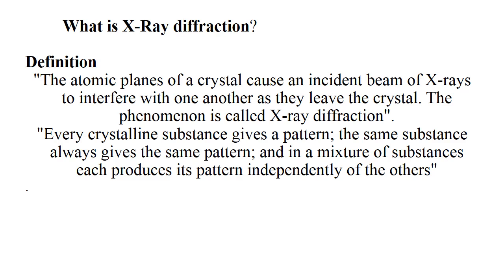The atomic planes of a crystal cause an incident beam of X-rays to interfere with one another as they leave the crystal. The phenomenon is called X-ray diffraction, and the interference should be constructive interference.